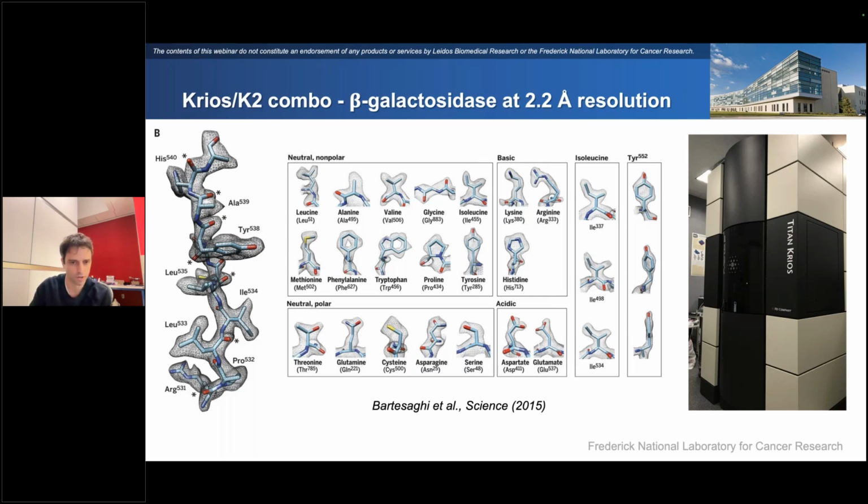So whereas before on the CCD technology or with the other early direct detectors, we were getting to about sub-nanometer resolution, once Shriram made the switch to the K2, we immediately saw an improvement in the map up to a resolution where we could fit in side chains. The resolution we got to in that early map was 3.2 angstroms. After we got to 3.2, we were all excited in the lab. It was the first time we had ever seen side chains in the map.